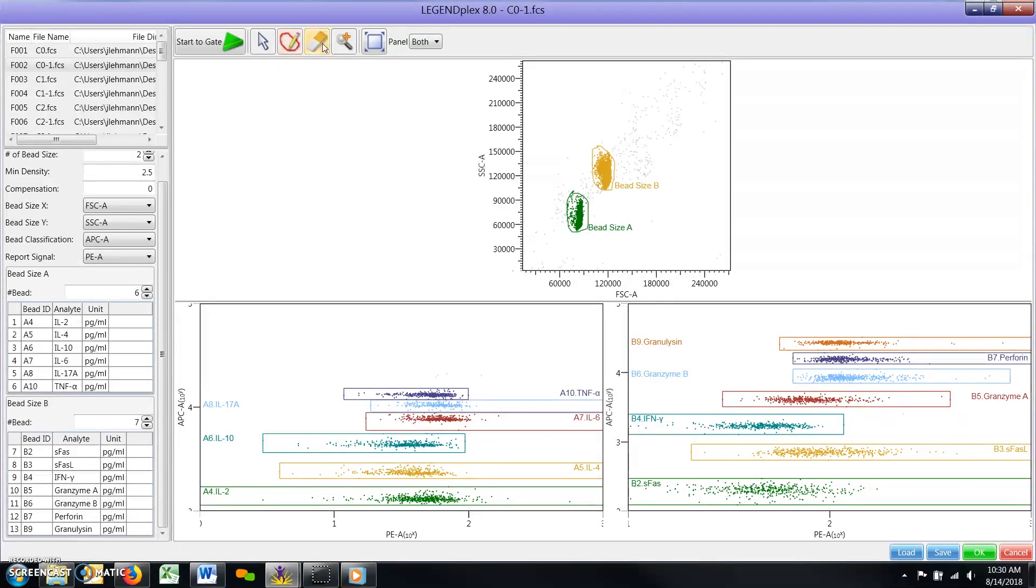Click on the gate you wish to erase. Note, if you click anywhere on the plot that does not contain the gate, then all existing gates in that plot will be erased.